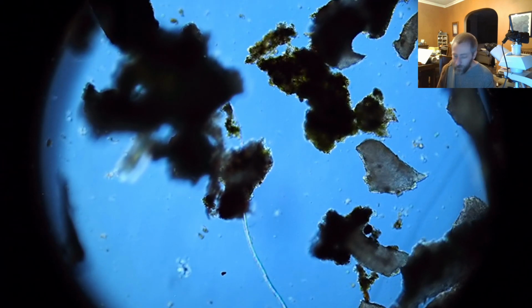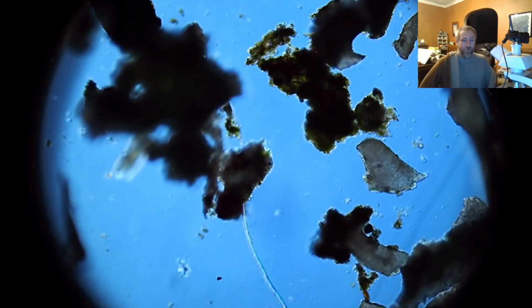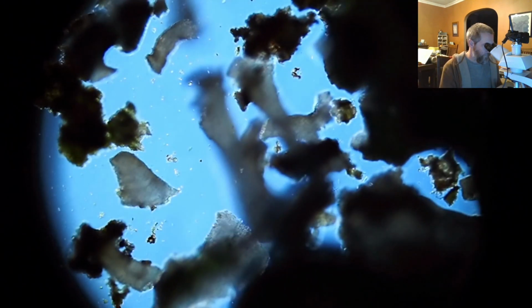I find water bears no matter what. I guess if you have really smooth skinned tree bark, I haven't been very successful with that yet, but any sort of rough tree bark with lichen on it seems to produce pretty good numbers of rotifers and nematodes and water bears in those samples typically. So I haven't had any trouble finding them since I switched to that.